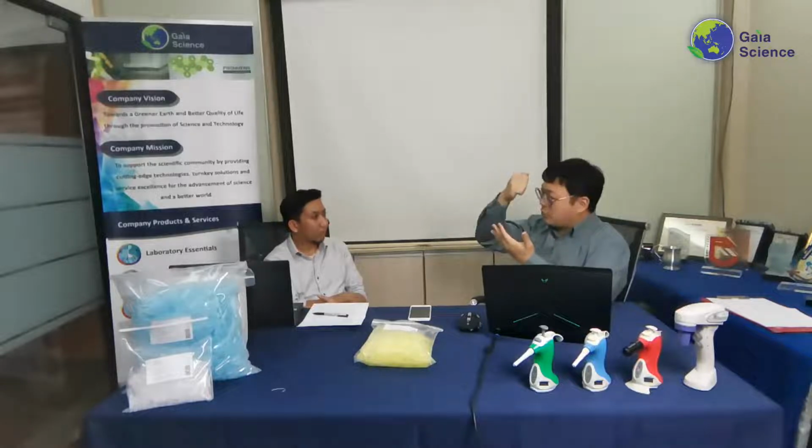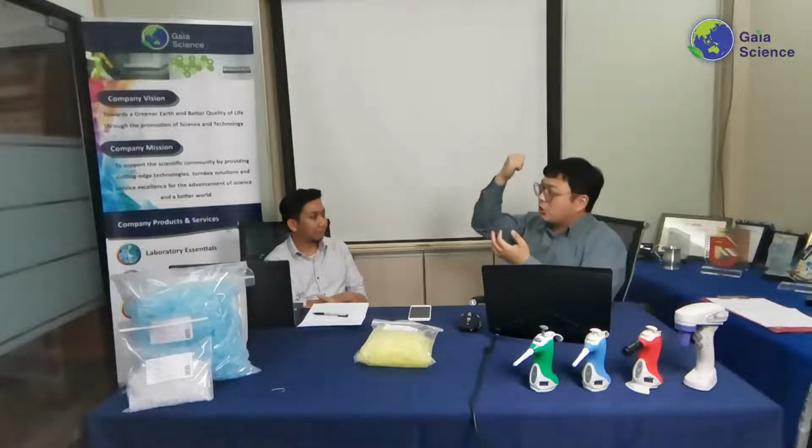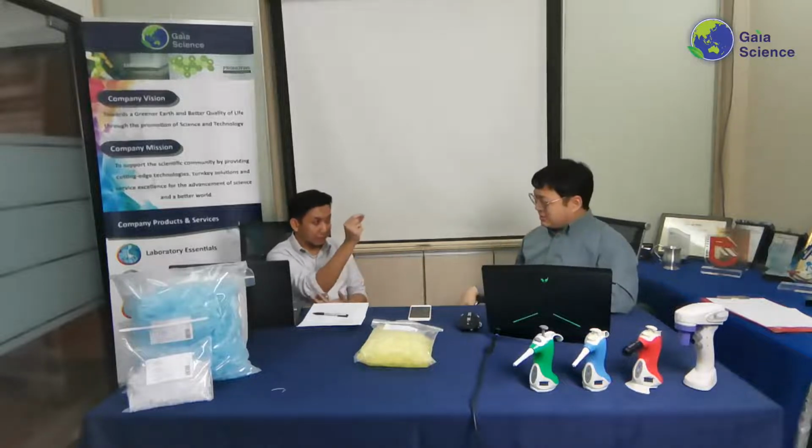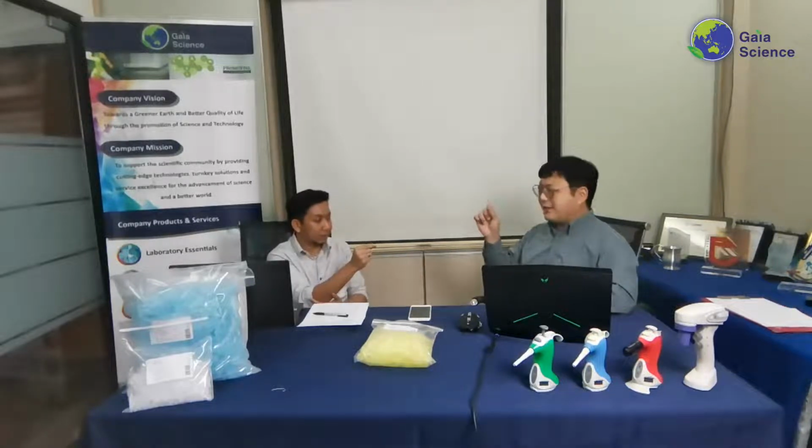I've seen before where they use the long ones for PCR, where they want to load, and after that they might use a longer tip so that they get a better angle. Whether they're using a short one so that they have more room to flex, I would say. I think that's one of those. I see. Because the extra long one, correct me if I'm wrong, the shape is also a bit thinner toward the end.